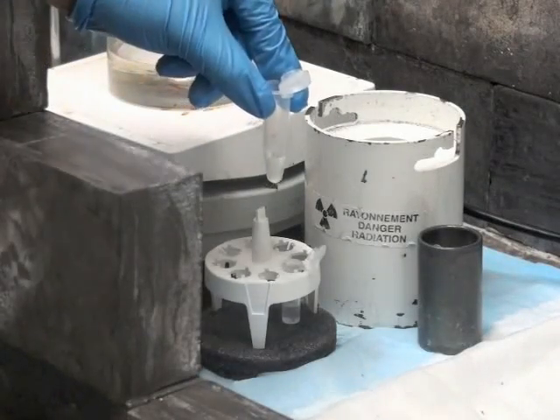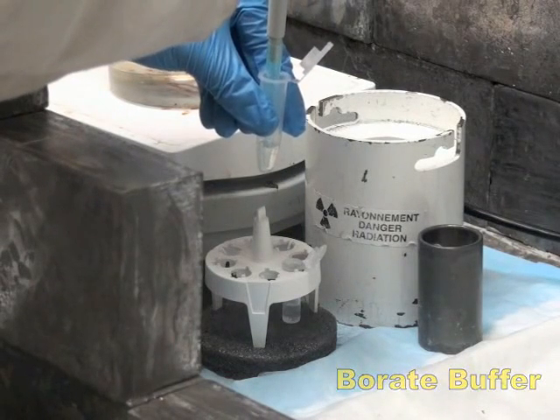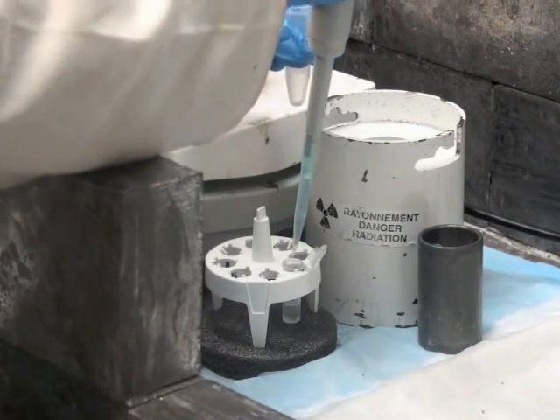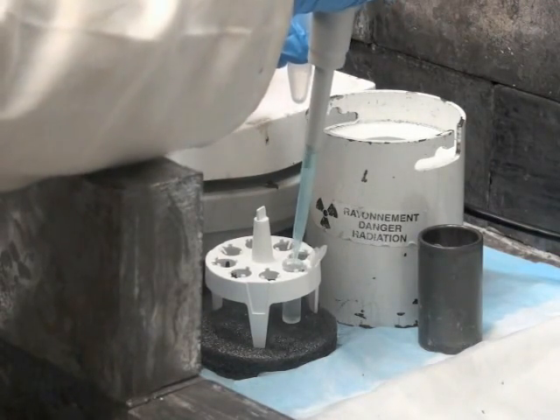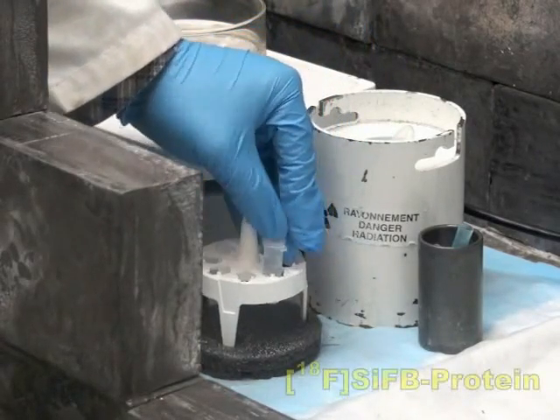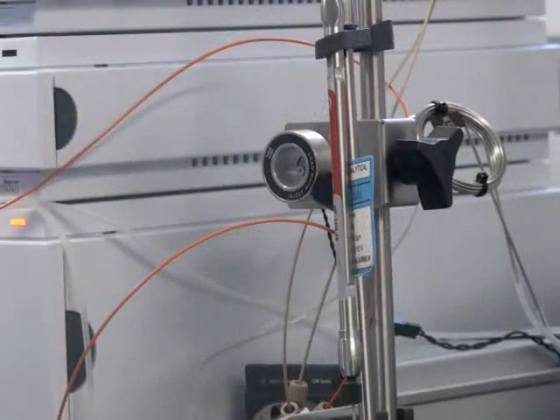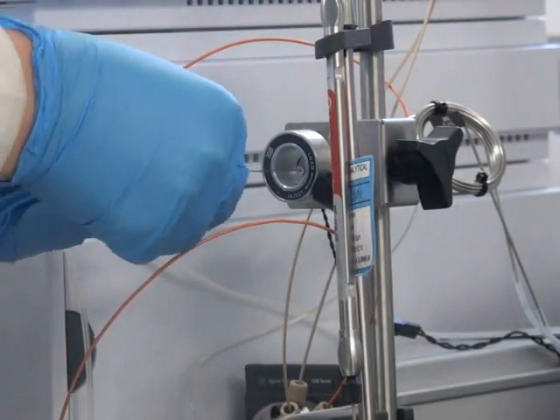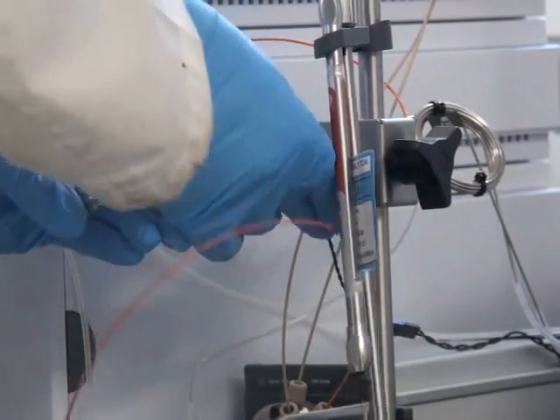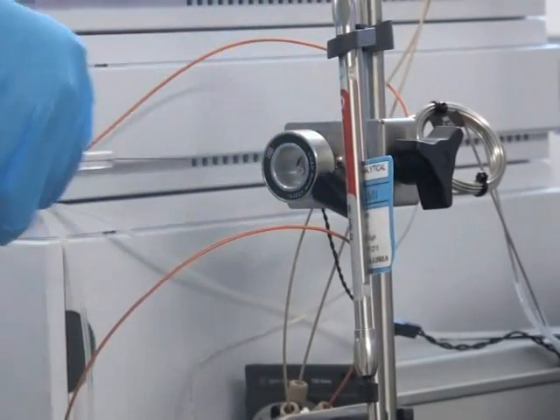Redissolve the fluorine-18 labeled SIFB in borate buffer. Add this to a solution of protein — in this example, rat serum albumin dissolved in borate buffer. After 30 minutes at room temperature, inject 5 millicuries of the solution onto a high-performance liquid chromatography system equipped with a size exclusion column to purify the fluorine-18 labeled protein.